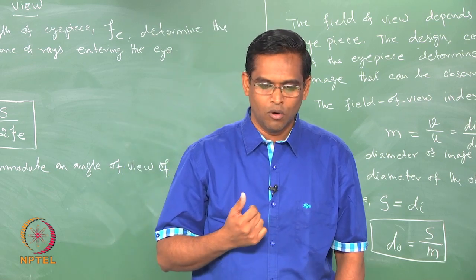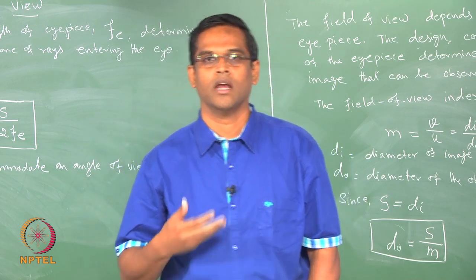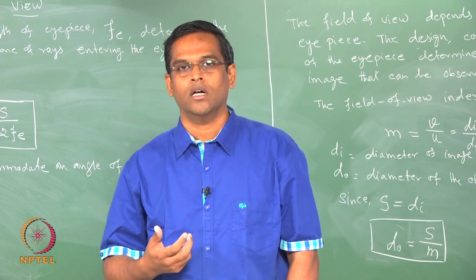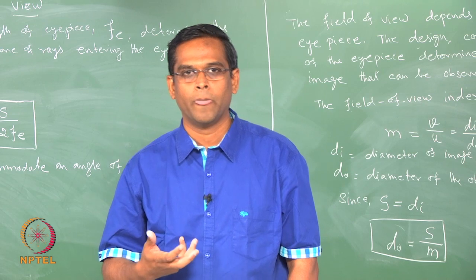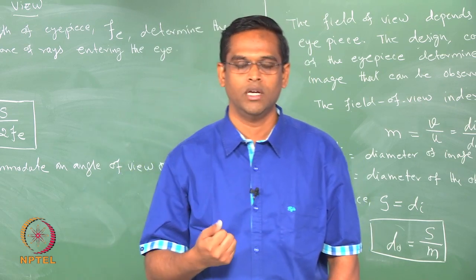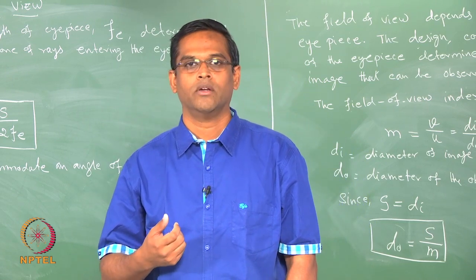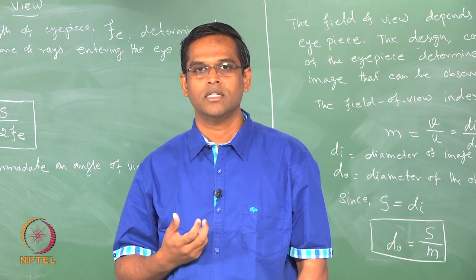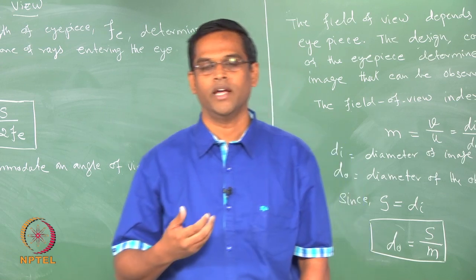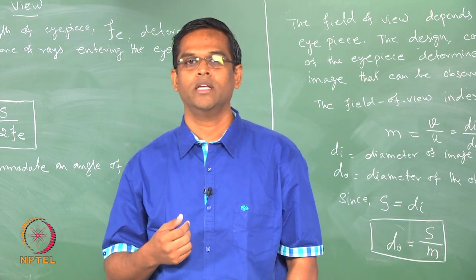Now we will talk about lens defects. All the time we talked about an objective lens and an eyepiece and their characteristics and light gathering power and so on. All this light gathering power, which has complete control of image quality, also depends upon the defects of the lens. So let us first look at what the lens defects are in general, and then we will see for each defect how it can be corrected for a better quality image.